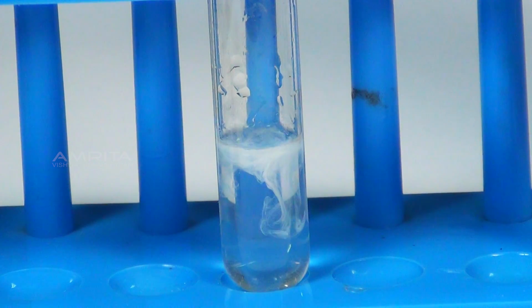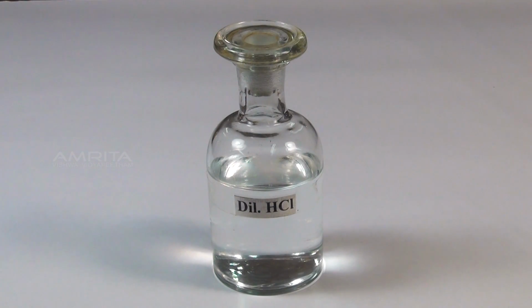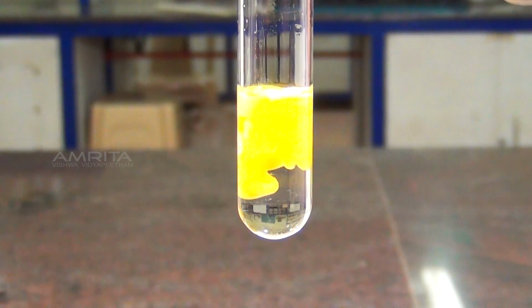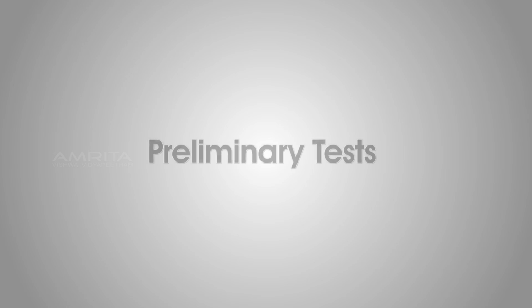In Group 1, lead-2 ions are precipitated as their chlorides by adding dilute hydrochloric acid to their solutions. Our aim here is to test for the presence of Group 1 lead ion in a given salt. First, we look at the preliminary tests of lead ion.